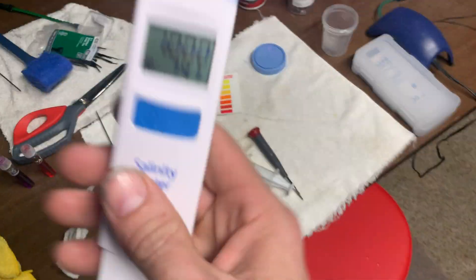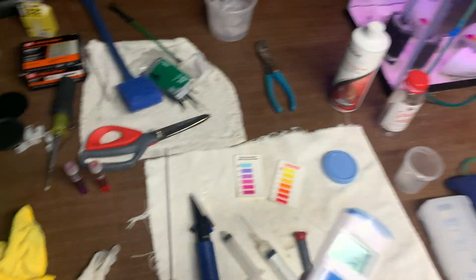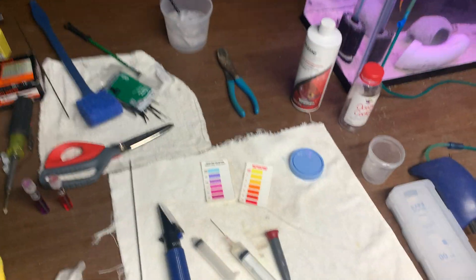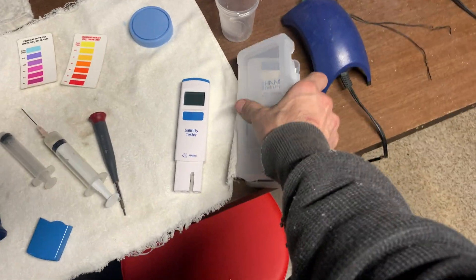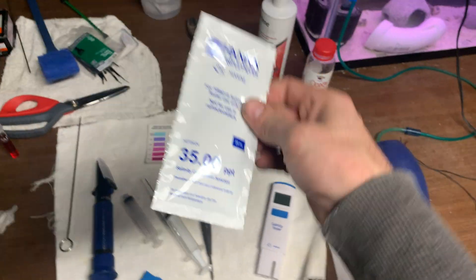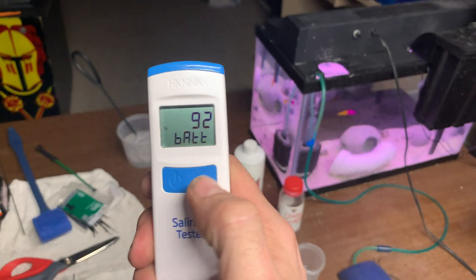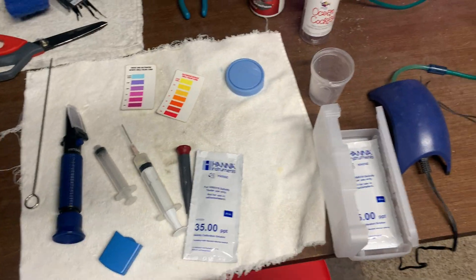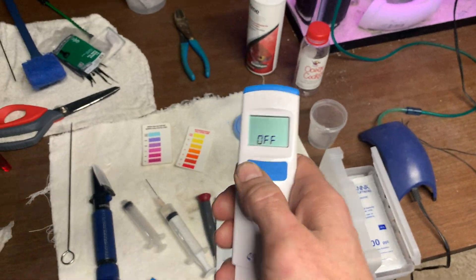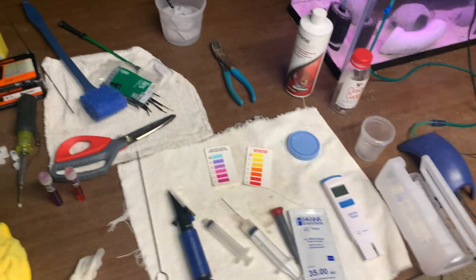I can stick this in every one of these and it's off on every single one. So I already filed a return on Amazon. They're sending me a new one. When I first got it, it was the same as the others. Then I noticed — I thought I used this thing for a month straight, and then I checked my water with this and I was at 1.028, which is way higher than I should have been. So I calibrated it. To calibrate it, it's pretty easy — you take this packet, rip it open, stick the meter in all the way to the bottom and hit calculate. It will say storing and then it will be done. You take it again and stick it back in there and it should read 35 or 1.026, and it does — it reads it spot on. But when I stick it in my tank water, it reads wrong.